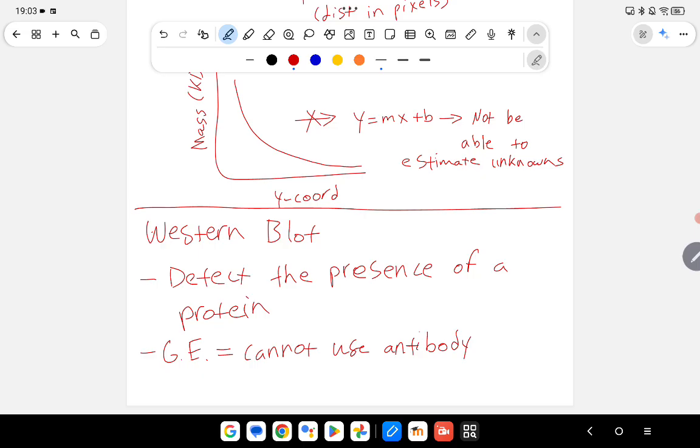Oh, one more thing. The reason we extract muscle from different species of fish is to check if they're statistically significantly different from each other. We just wanted to see if the weight of the myosin light chains was different between the tilapia and salmon using numbers.